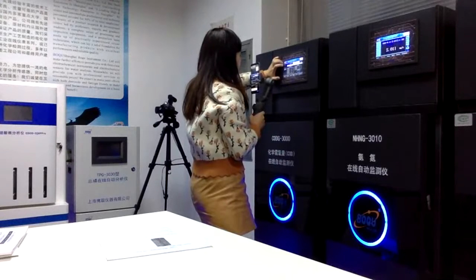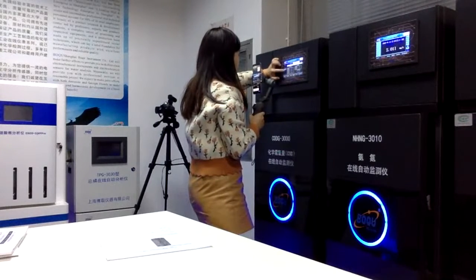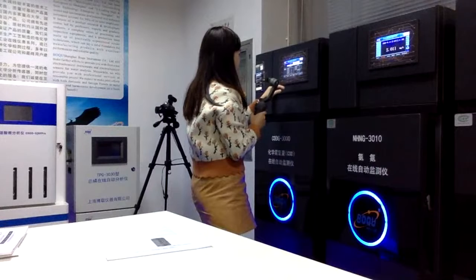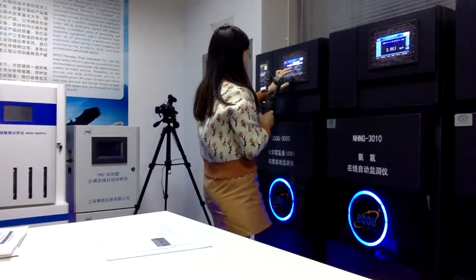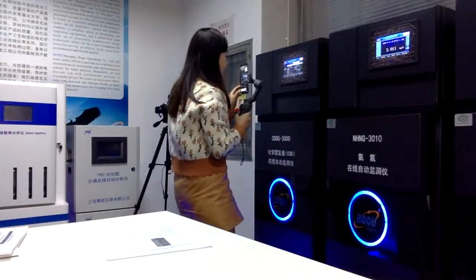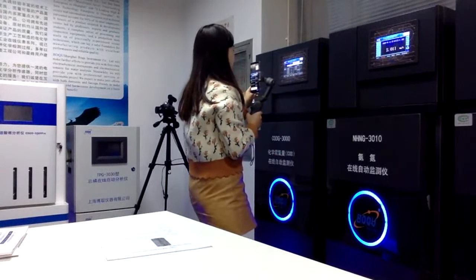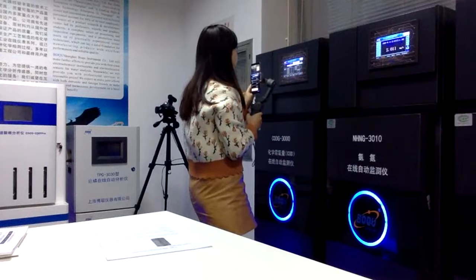measuring temperature. Right now you can see the temperature is also fluctuating. And also the measuring signal and reference signal and the high level signal and low level signal. All of the data is set here. And by the way, we also have the distilled water signal and standard solution signal and also water sample signal. So this part is the whole signal page for the analyzer. Just make sure all the signals are working properly, and if there is any abnormal signal, then you need to come to this page and check it out.